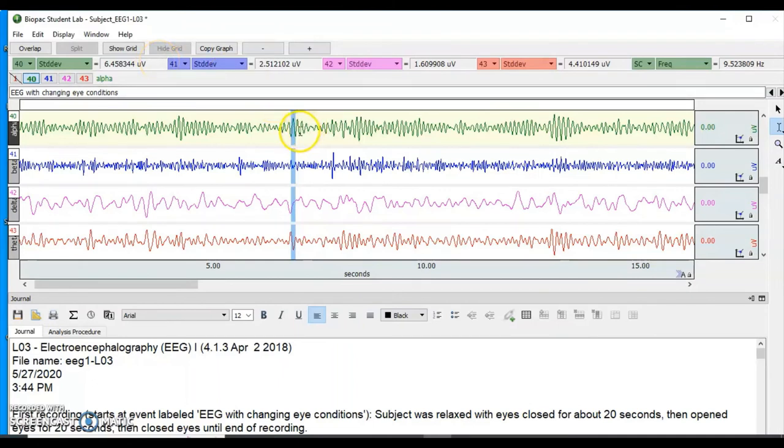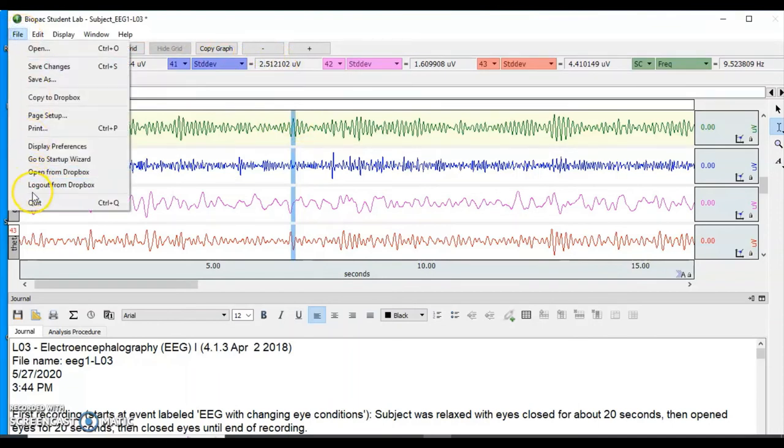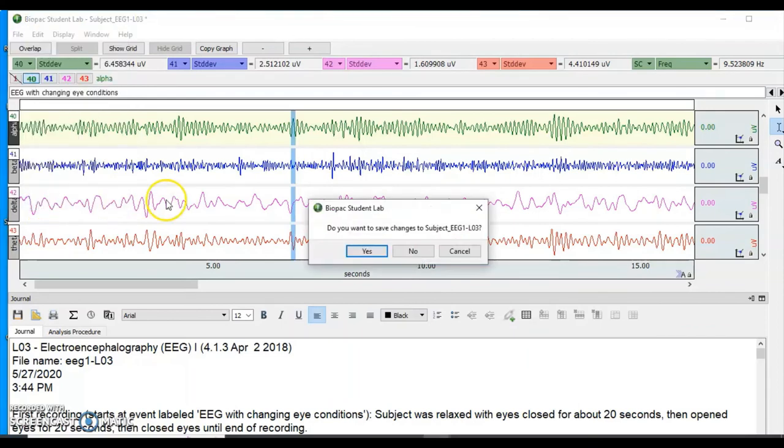That should be all you need to record all the data you receive from an experiment. Once you're done, you want to click File and Quit to close. But always make sure that you don't save your changes. You don't want to alter the data.